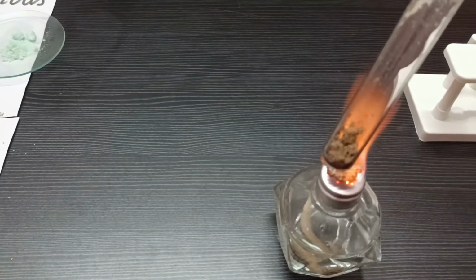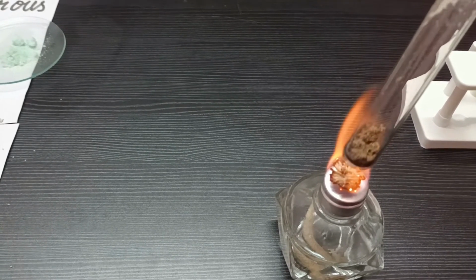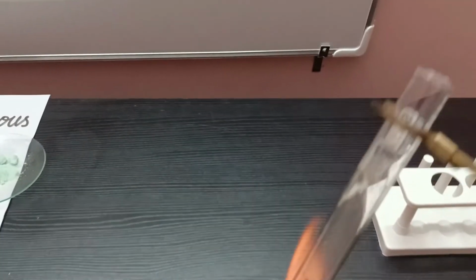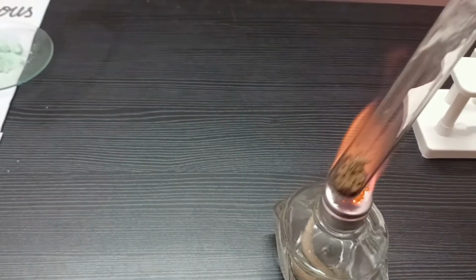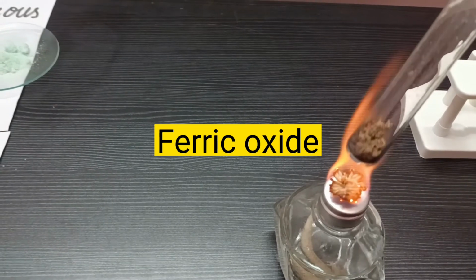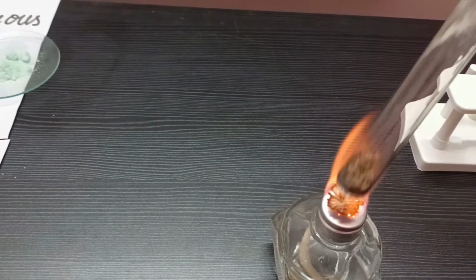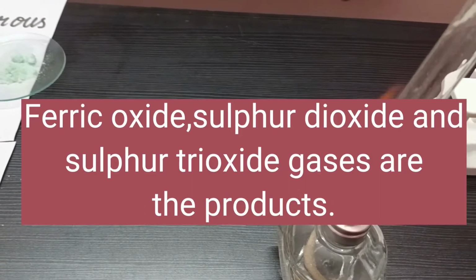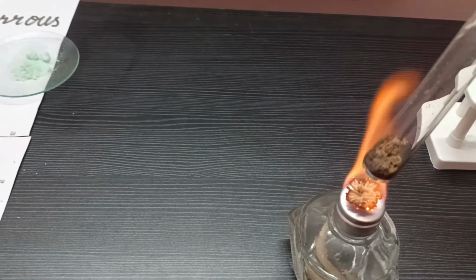The gaseous products, sulfur dioxide and sulfur trioxide, have escaped from the test tube. Now what is left in the test tube is ferric oxide. So as a result of the decomposition reaction of ferrous sulphate, three products are formed: ferric oxide, sulfur dioxide and sulfur trioxide gases.